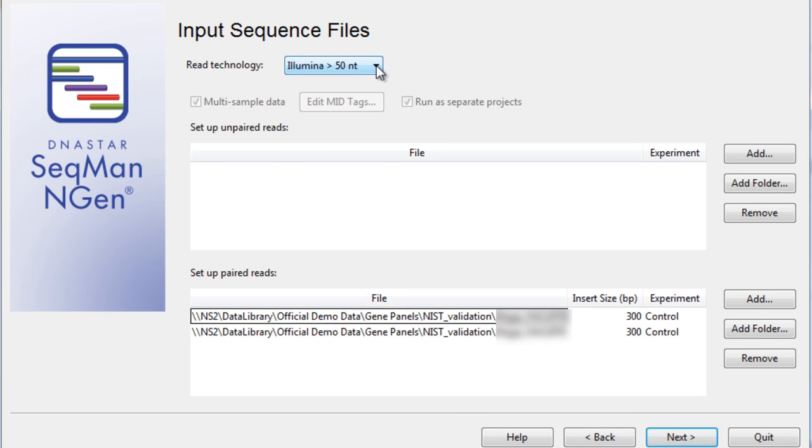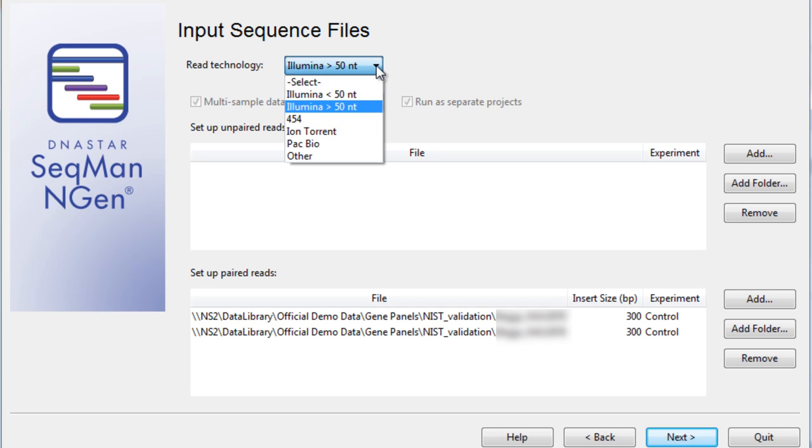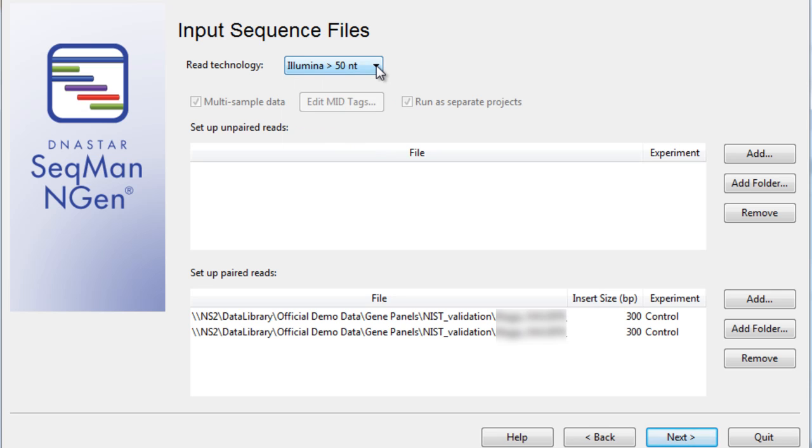Next, we'll select our read technology. I'll be using Illumina data for this particular example. I've imported two different sequence files, designated my insert size, and named my experiments.